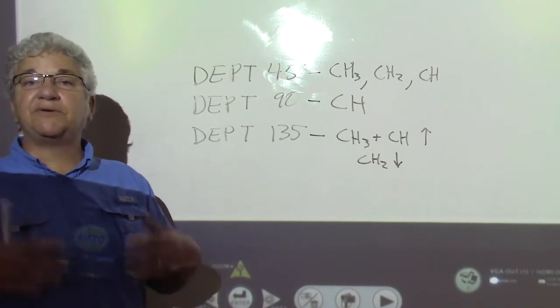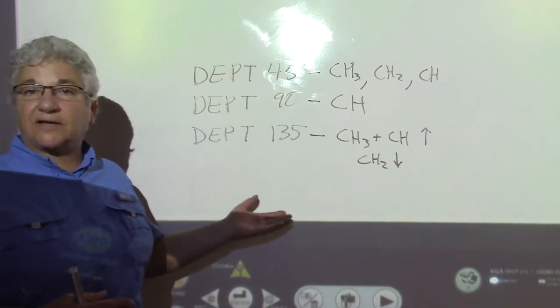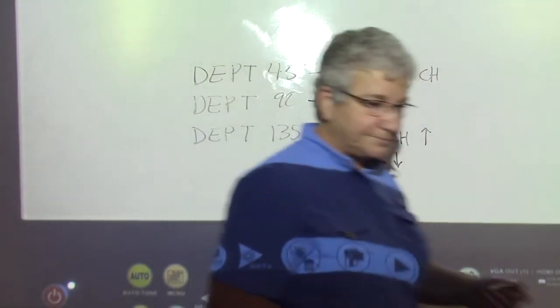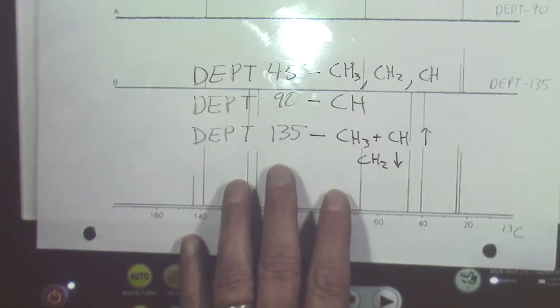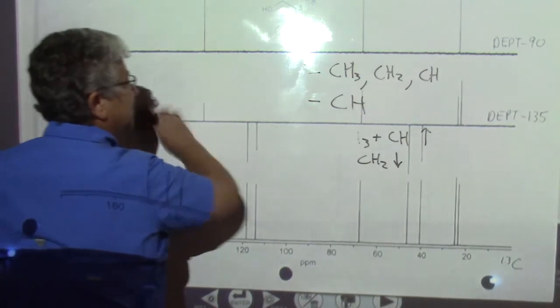Again, if you're trying to build a molecule from scratch when you don't really know anything about it, collect the spectra, excuse me, then you'll know a lot more. Okay? So an example, and I'll go ahead and post this example for you.